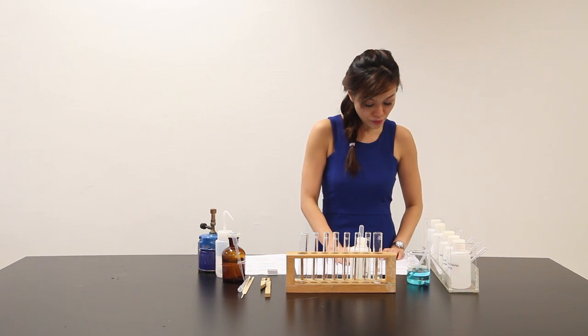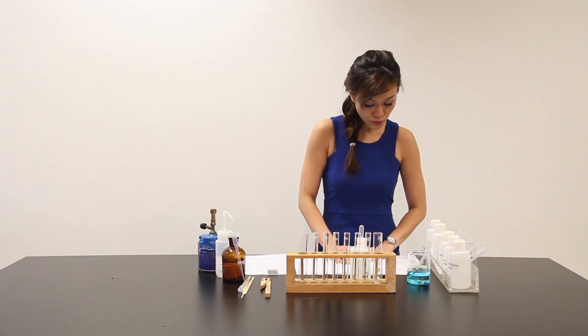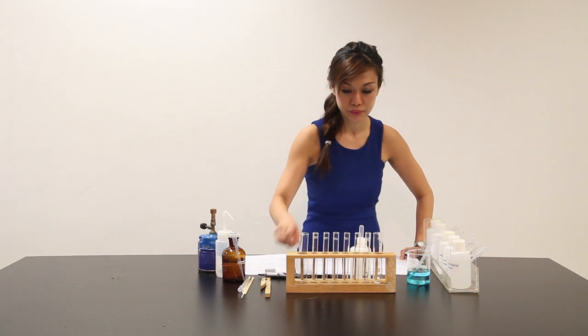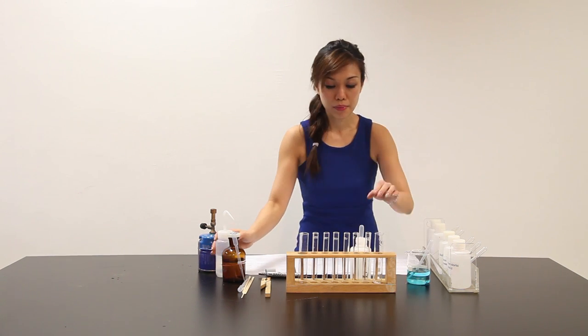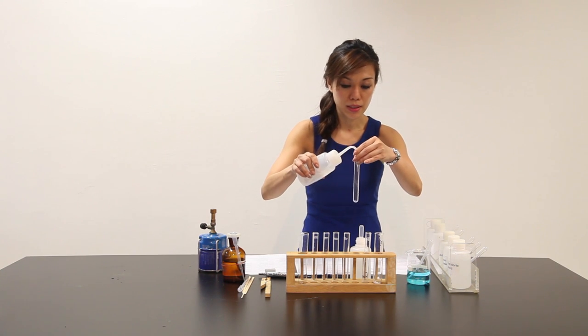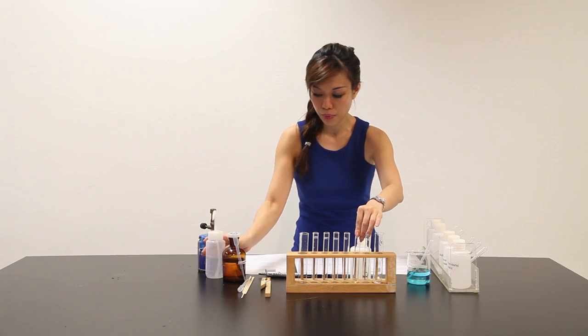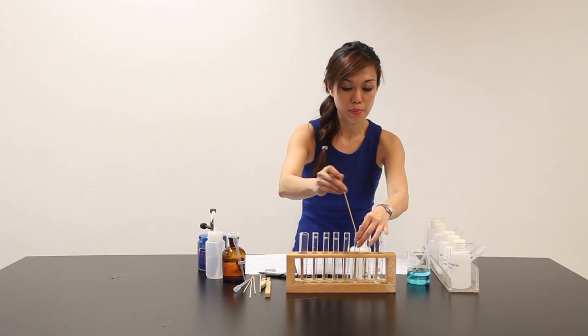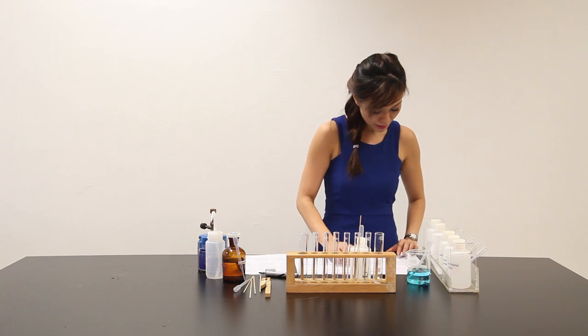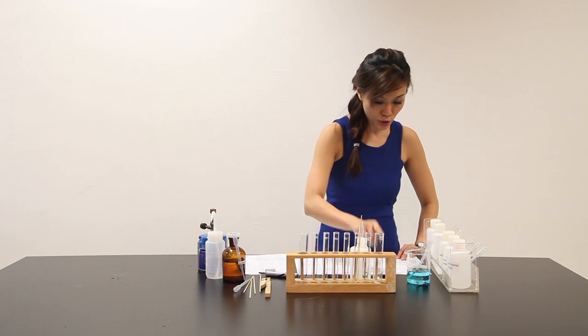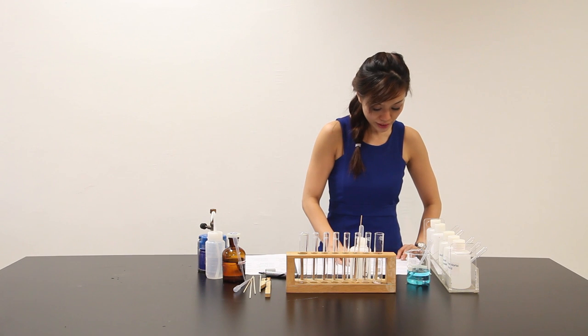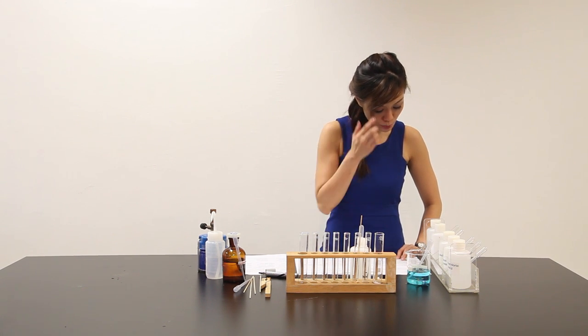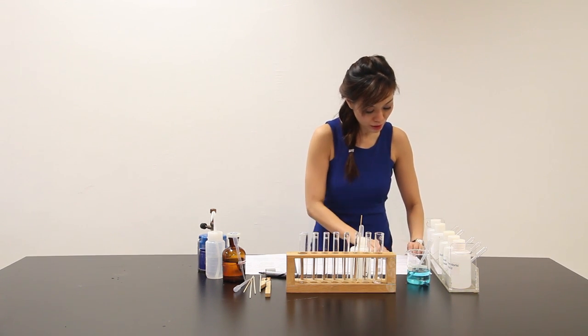Adjust the Bunsen burner to give a blue flame. Moisten the end of the wooden splint with water. I'm going to use the distilled water here. Let me fill this with a little bit of water. Moisten it. Let me put the splint inside. And later on, I can just moisten the tip here with solid X. Place this end of splint in the Bunsen burner flame. Record your observation.